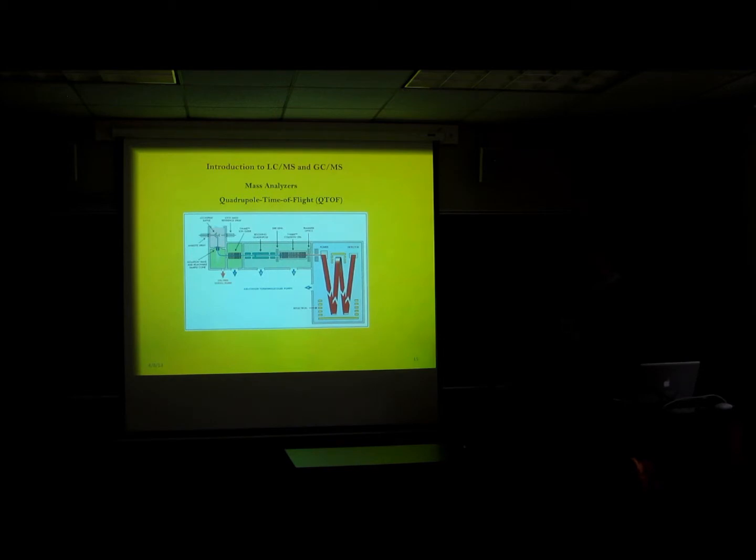with high efficiency separations. Basically what you're doing with the time-of-flight mass analyzer is you're taking a packet of ions and pushing them all with a given specific kinetic energy. And if all of the ions of different mass to charge ratios have similar kinetic energies, the compounds with smaller mass to charge ratio will reach the detector first. Those with higher mass to charge ratio will reach the detector more slowly, and you can calibrate that time of flight to reach the detector to mass, and you get a mass spectrum based on the time of flight of those ions through the detector.